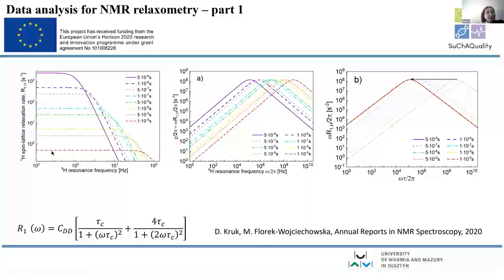So you have the case here. The relaxation rate is frequency independent in a very broad range of frequencies, because almost until here, the product omega tau c, if tau c is 1 nanosecond, can be neglected compared to 1. So this expression becomes frequency independent. Only here for high frequencies, one can see that it bends down, so it shows a kind of frequency dependence.